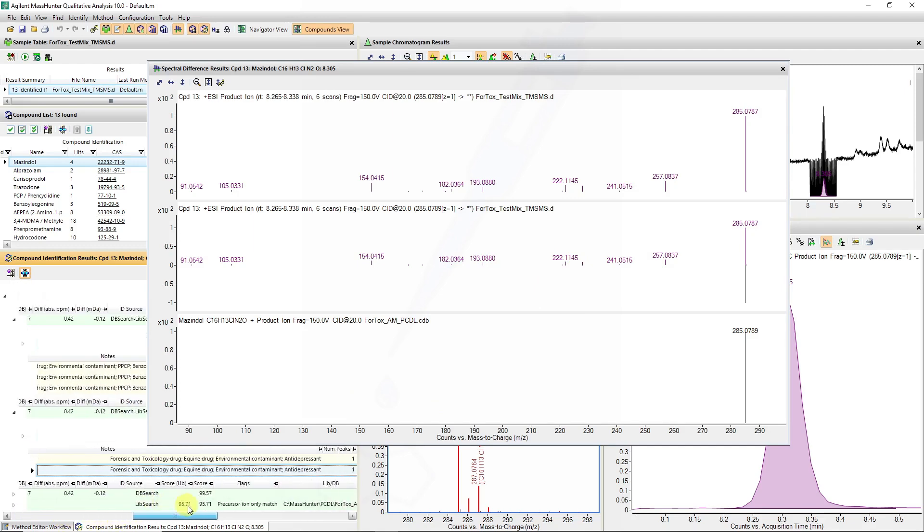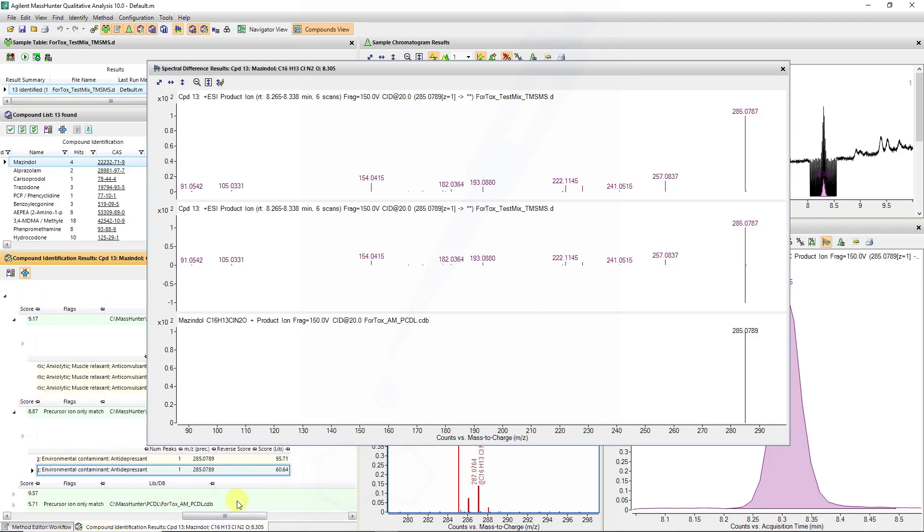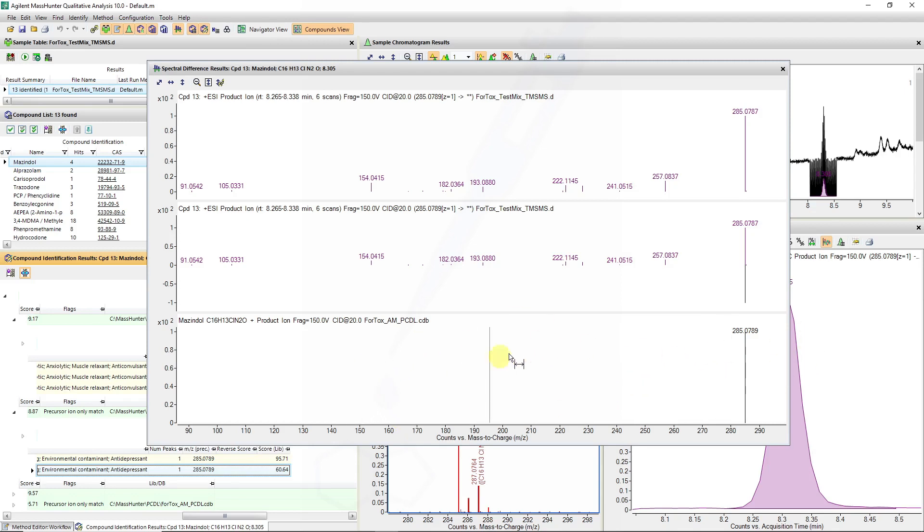Our reverse scoring has not been computed because the reverse scoring is when the library entry is compared to the data file and it didn't have a good match therefore.